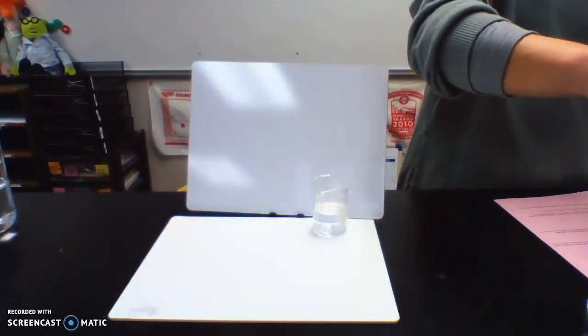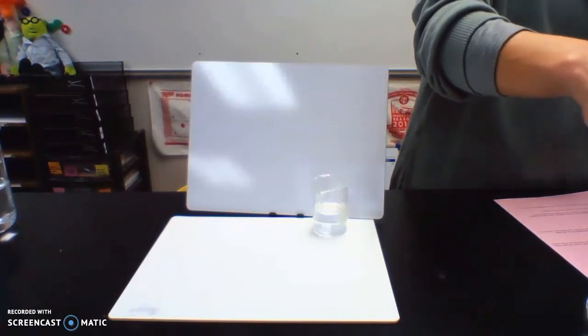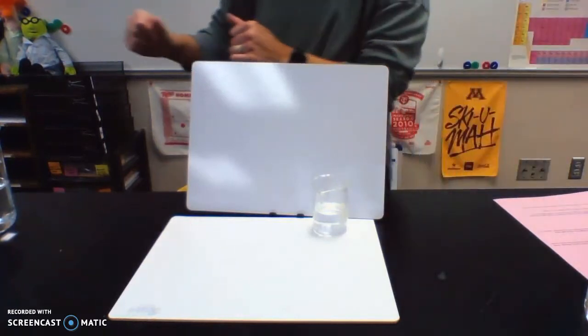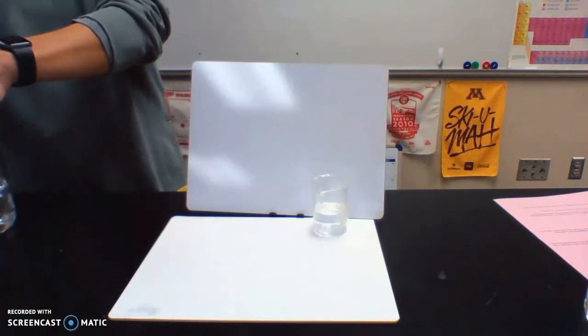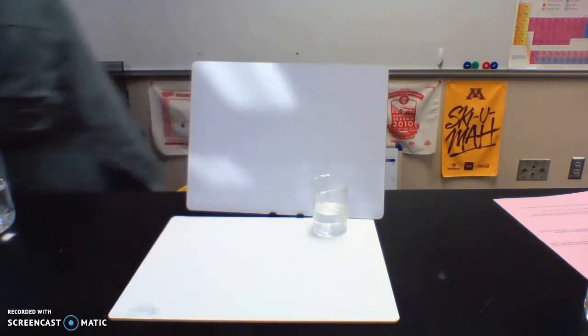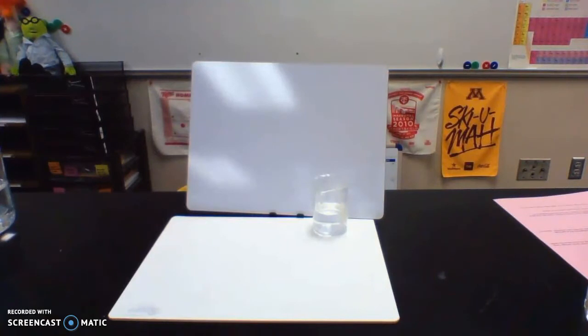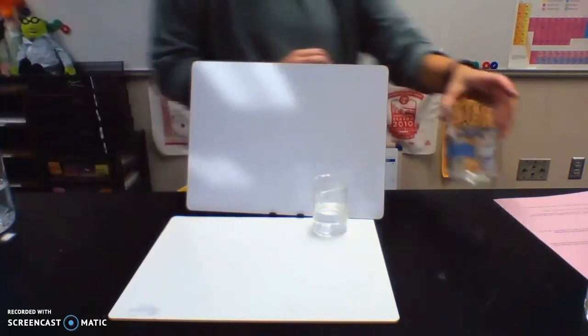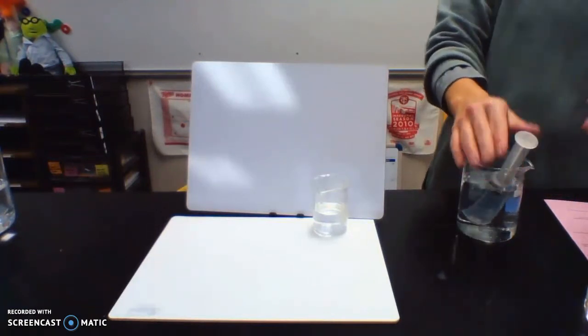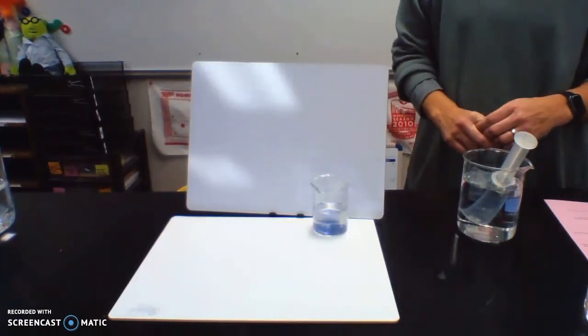As soon as you see any sort of color change, stop it. Oh, there we go.